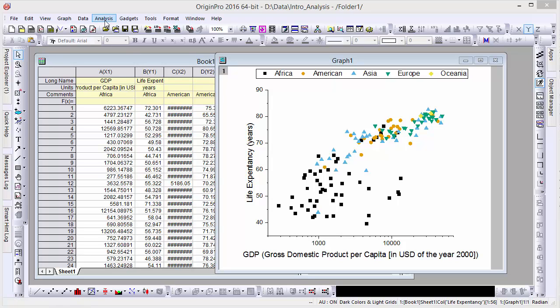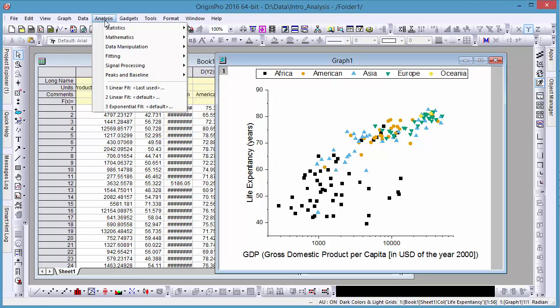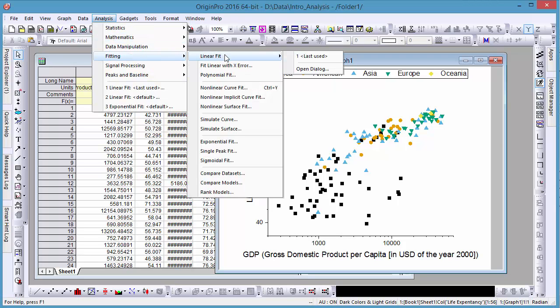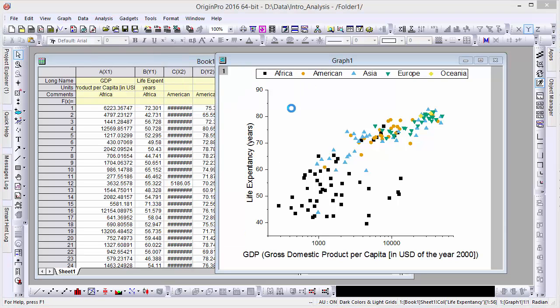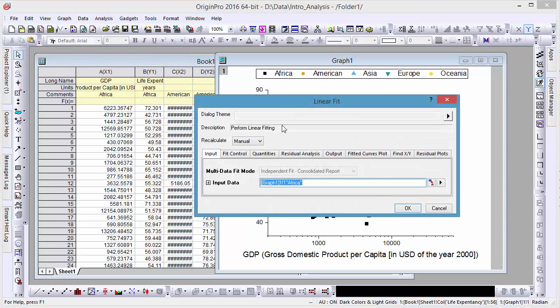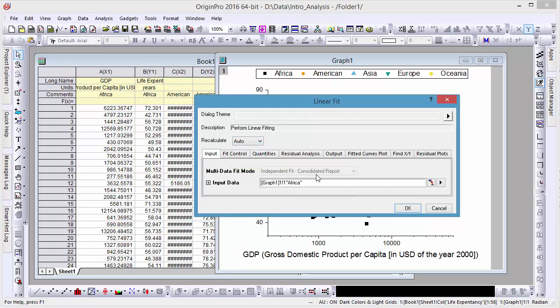Most analyses in Origin support recalculation. For example, if I perform a linear fit on my data, notice I can set the recalculation mode to Auto. Origin picks one dataset by default, so let's select all plots in our active page.